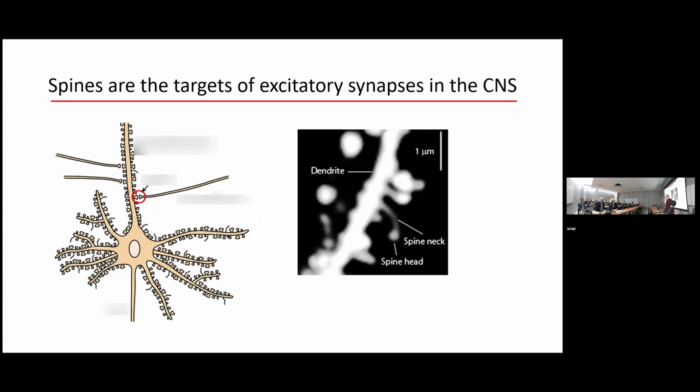If you want to understand synaptic integration, a very fundamental process of what goes on in the nervous system, you want to know what happens when individual inputs, action potentials coming along these presynaptic fibers, arrive. What do they do? But it's hard to actually make recordings at the target because these spines are so small. So what people have done, and we are in that tradition, is to use imaging techniques where we try to reveal information about what goes on there by finding a transducer that can tell us something about what's going on.